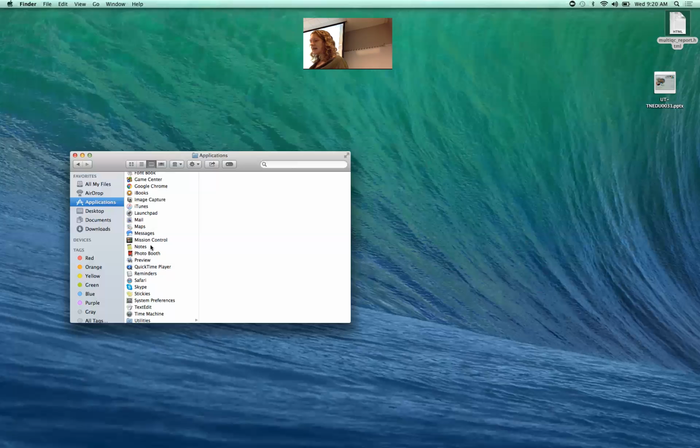Per base N content, again, I'm seeing this one sample, IC2, has a significantly higher percentage of N's than any of our other samples. These two, LT3, IC3, are a little concerning as well, but IC2 is really sticking out on all of my graphs.